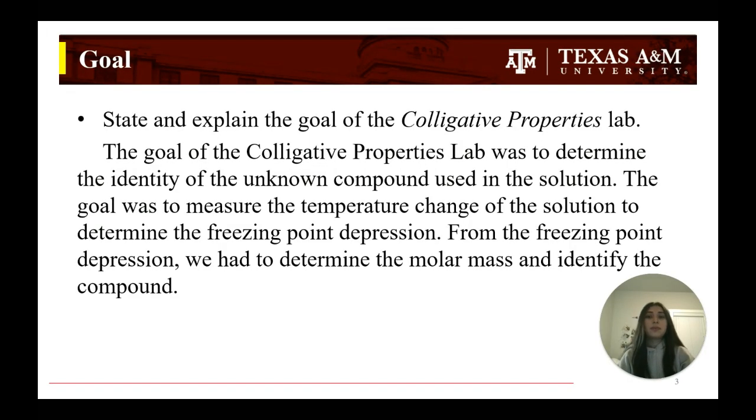The goal of the colligative properties lab was to find out the identity of the unknown compound. We did this by using the temperature change values to find the freezing point depression, and from that, we found the molar mass of the compound.